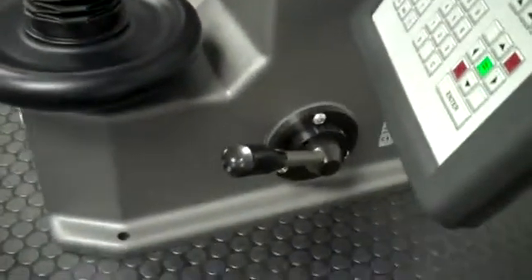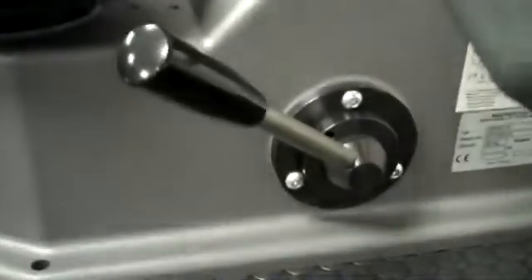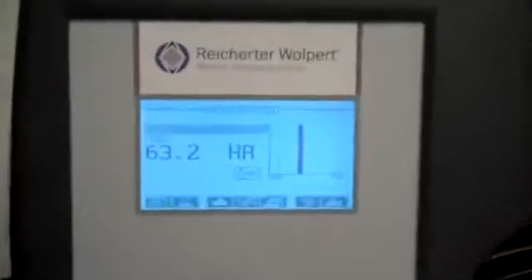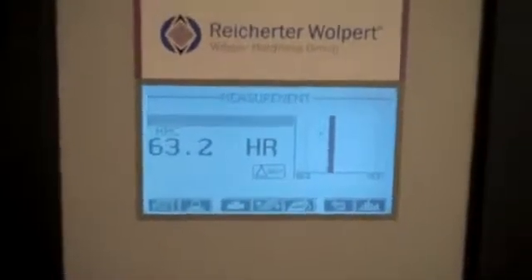To apply the load, we turn the elevating screw until we clamp the part in. There's a two-position handle — it's in the up position now — and pulling it down applies the load, with results displayed on our display. You can see a result from a previous test of 63.2.